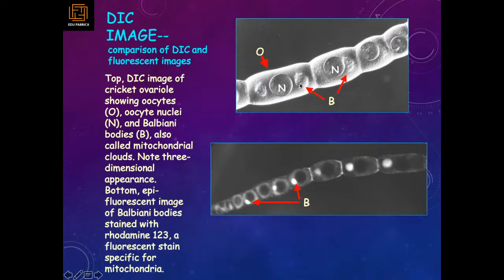The cells that we are seeing here, we can see the proper structure, proper curves coming up. We can see these bulges on top. We can see these Balbiani bodies on top also. It's like a moon in 3D. But here it's like taking a 2D photograph with a very old camera. That's the difference of DIC images.